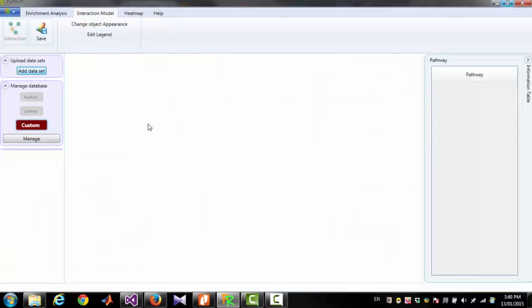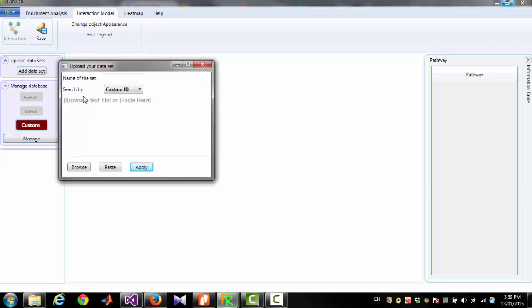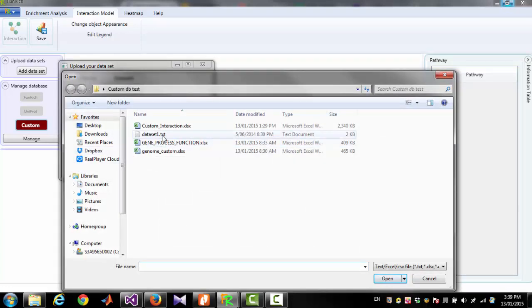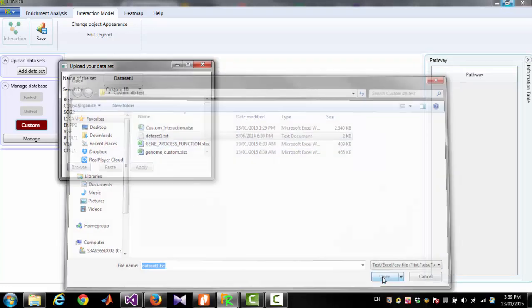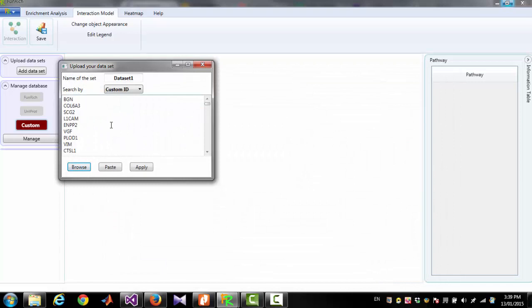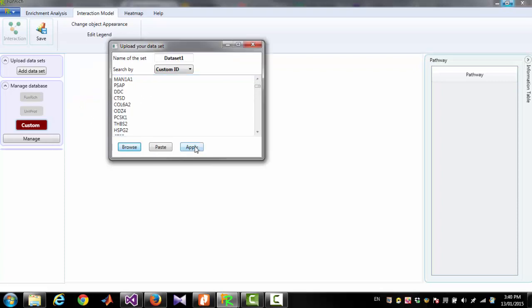After uploading the database, now you can perform analysis on a dataset. You can upload a dataset by clicking 'Add Dataset,' then giving a name for the dataset, for example 'Dataset One,' and upload a file containing either Entrez Gene ID or gene symbol, because we used gene ID and gene symbol as identifiers. Then click 'Apply.'